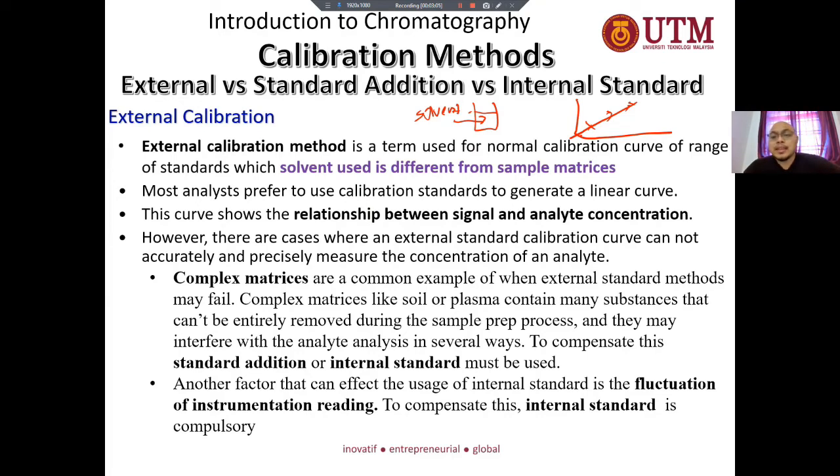If the analysis only requires water as the solvent, we can use distilled water. But the most preferred one, if water needs to be used as the solvent, is ultra pure water.